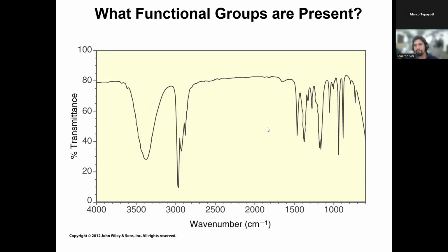They are usually very weak peaks. Alkane, well, by definition, everything that has a carbon hydrogen chain is considered somewhat of an alkane, but we're looking at specific signatures of functional groups. So in this case, Aiden was definitely correct. You have this broad, kind of medium strong signal at around 3500. That is characteristic of an OH functional group.